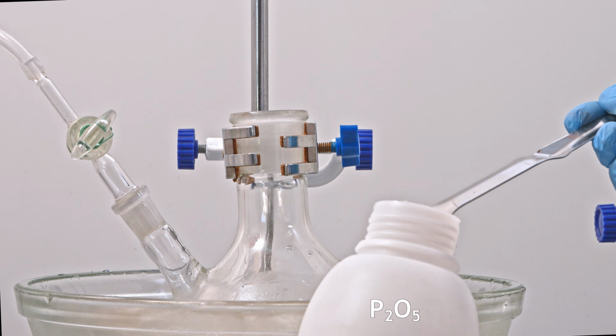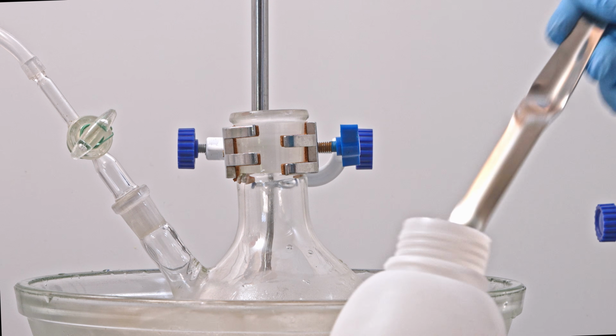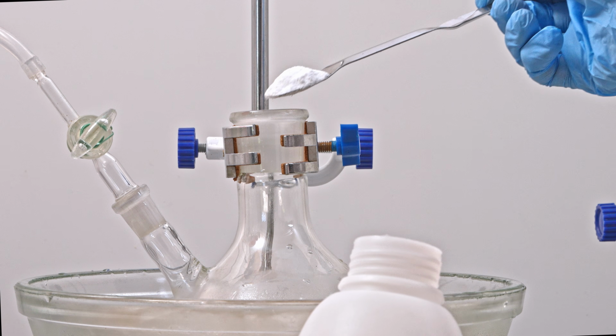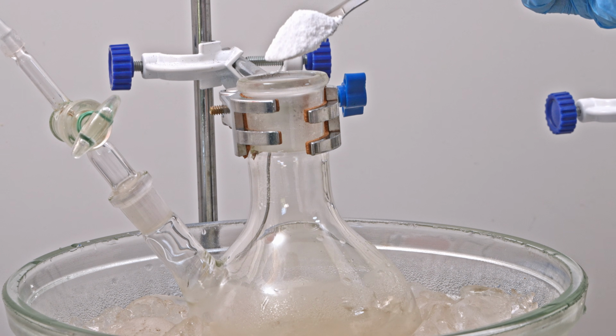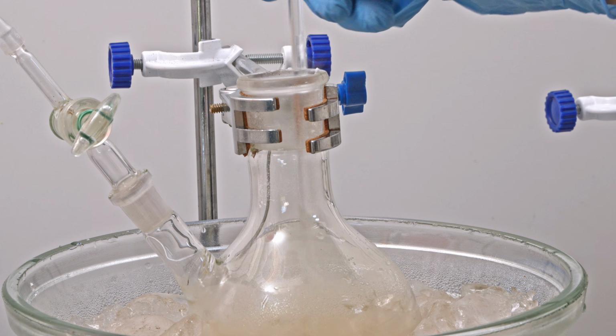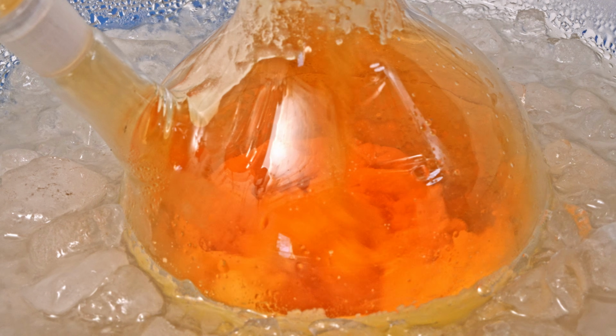After that, I begin slowly adding phosphorus pentoxide to the cooled nitric acid. As phosphorus pentoxide is added, the nitric acid slowly begins to turn yellow and give off brown fumes of nitrogen dioxide. I add phosphorus pentoxide gradually until the contents of the flask turn into a thick, dough-like paste.